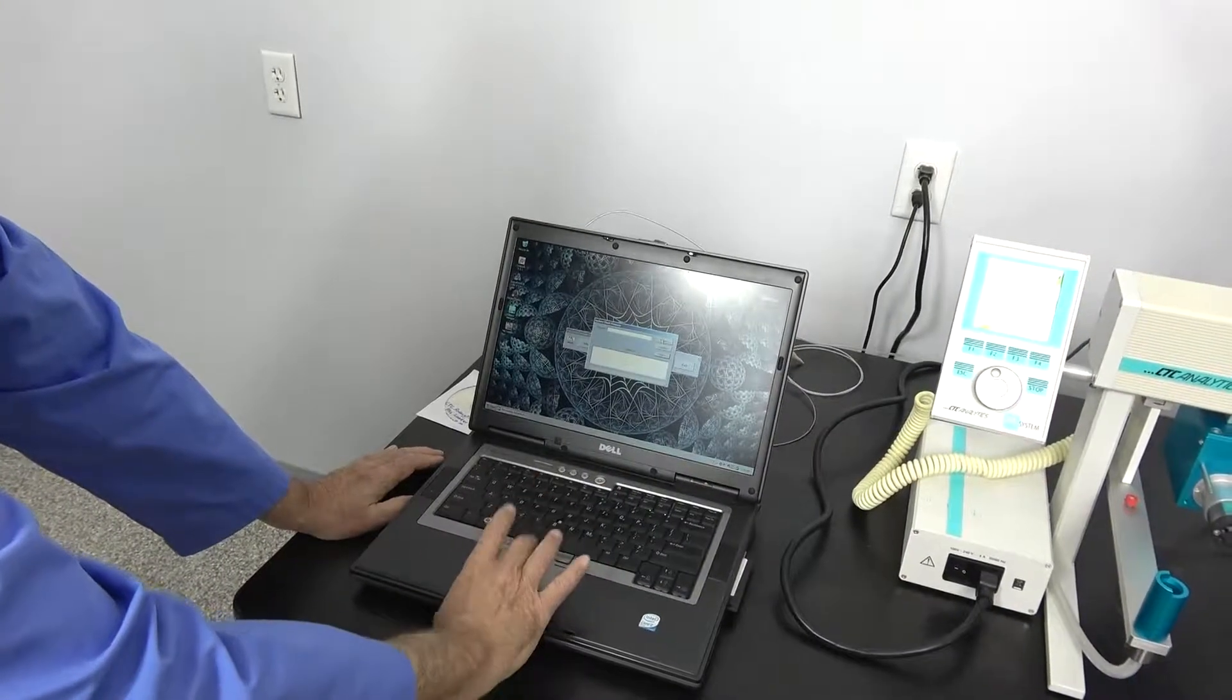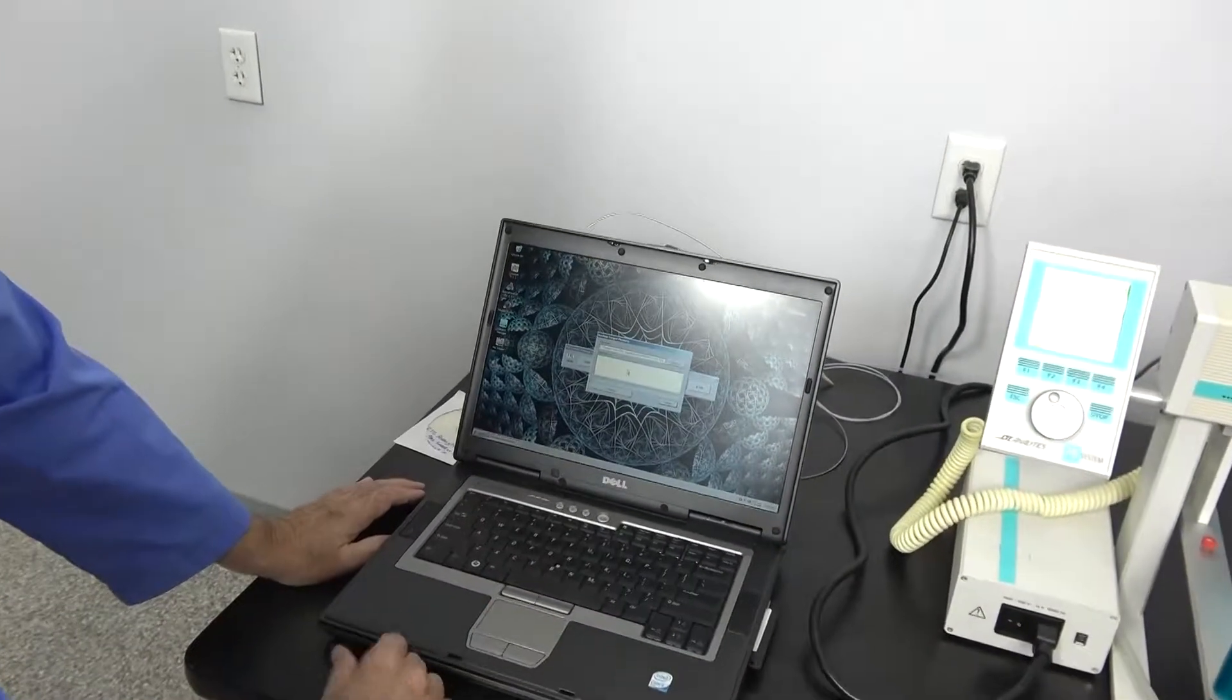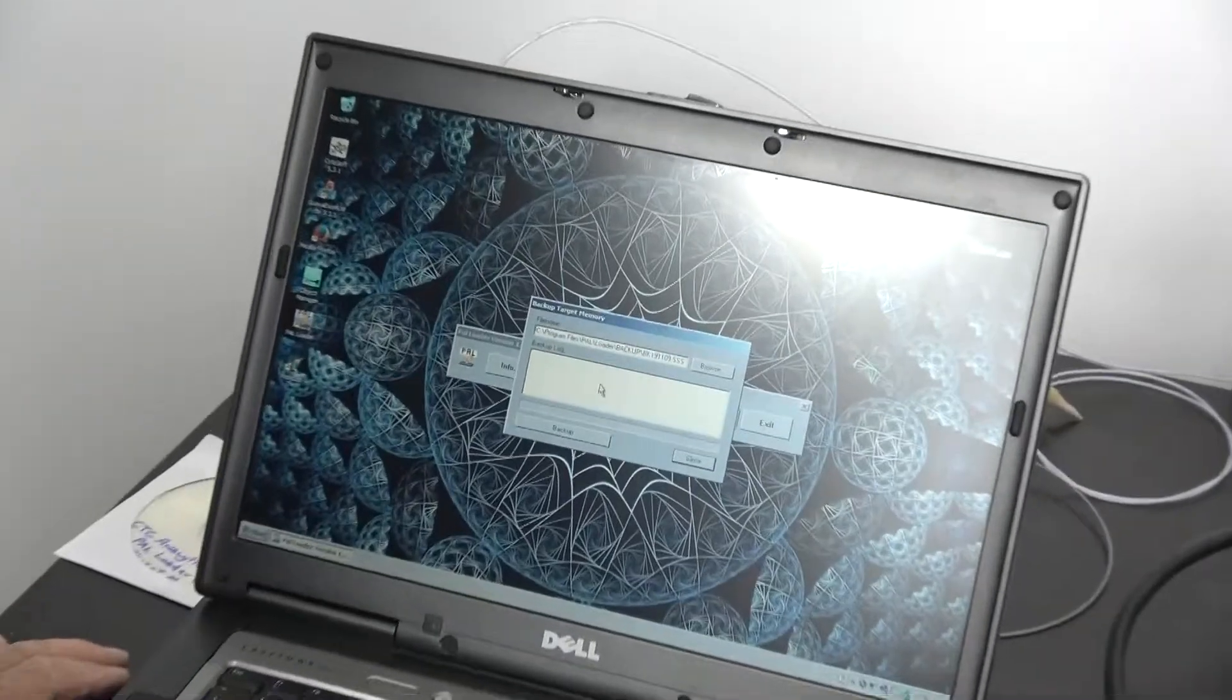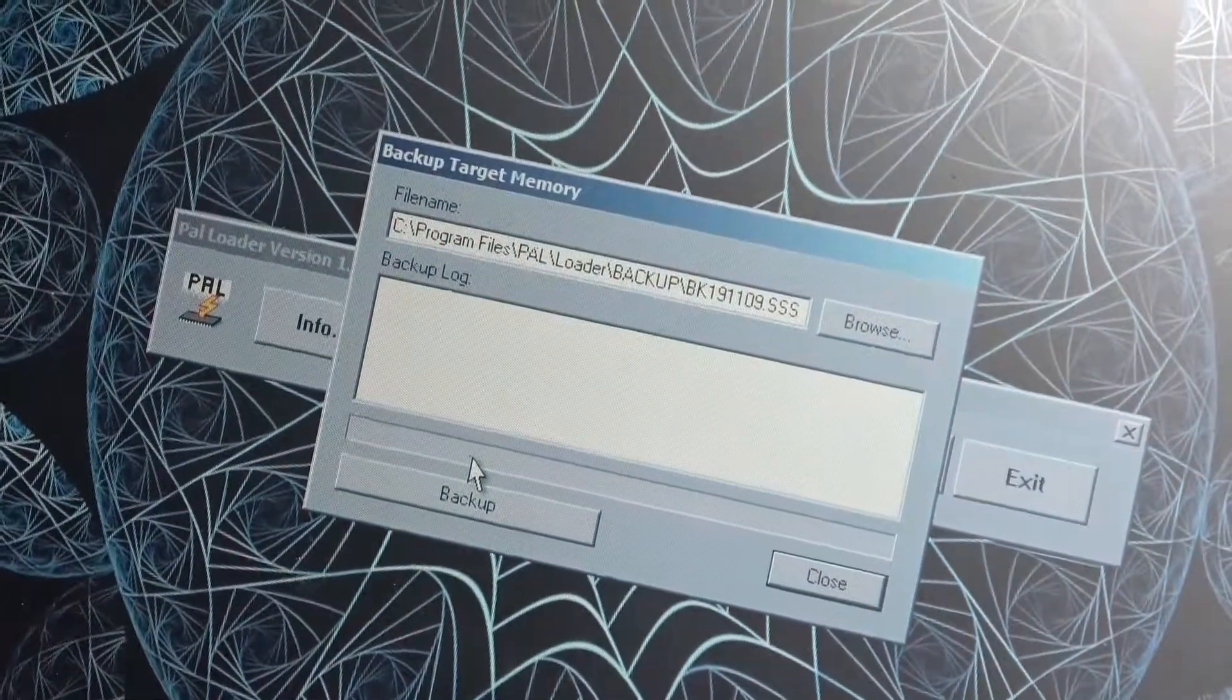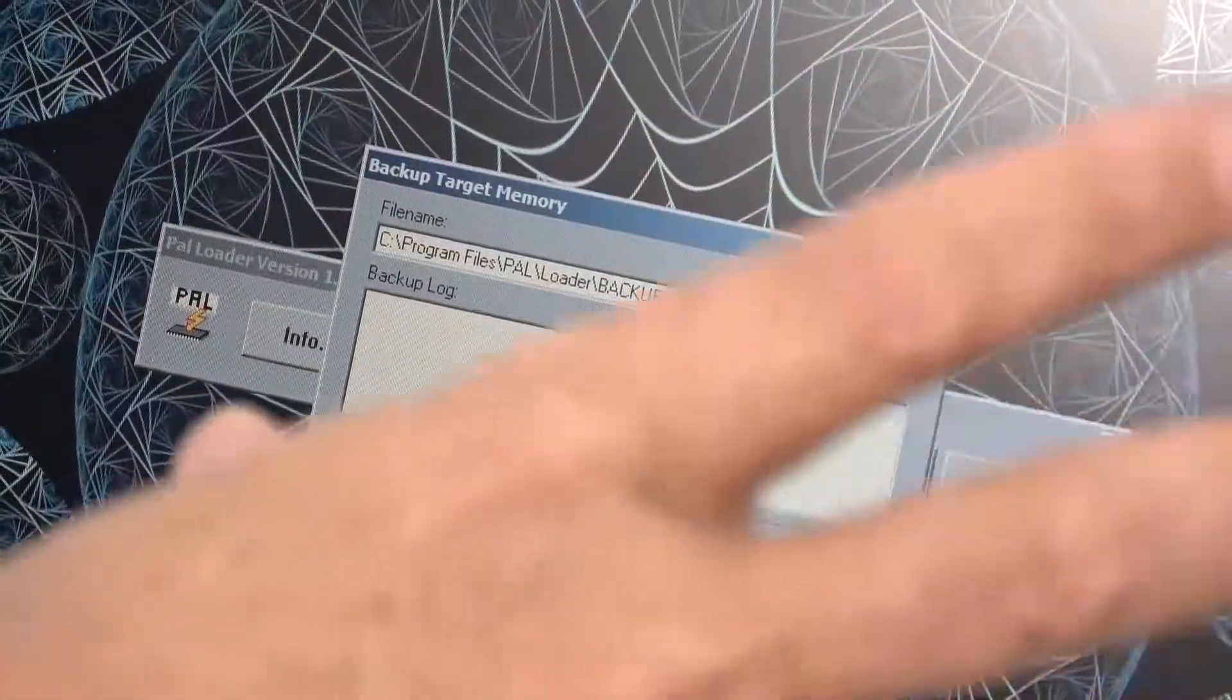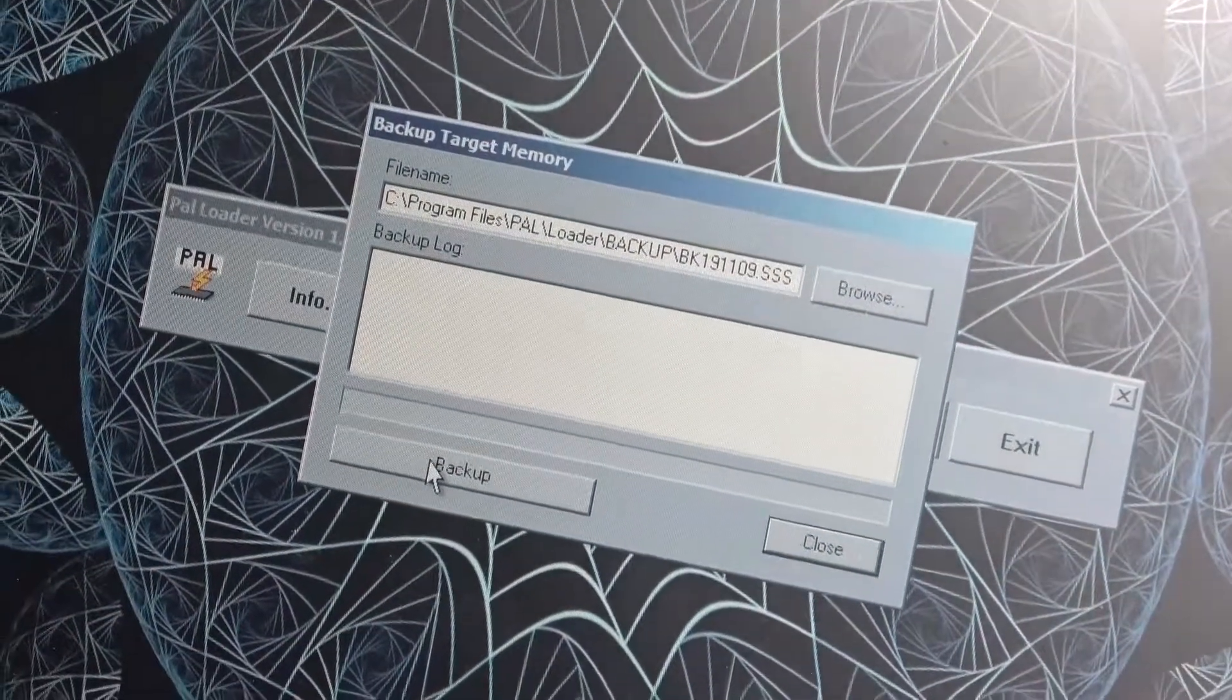You browse to tell it where you want to go. To back up your unit, you would click back up, tell it where you want to put it. It takes a few minutes to do so I'm not going to do the final back up here. It'll log into the system, download the information, save it to your hard drive.